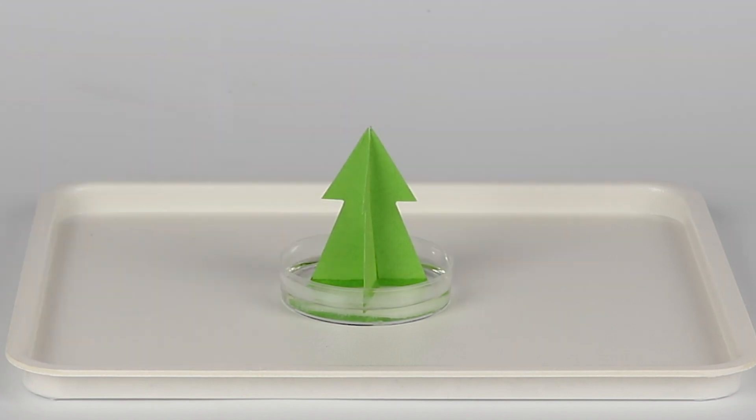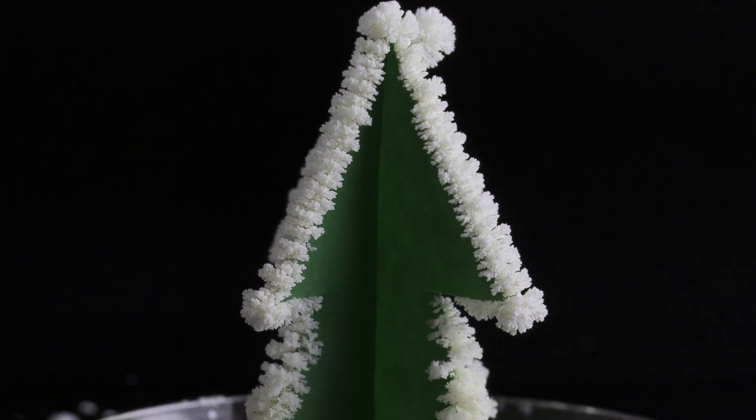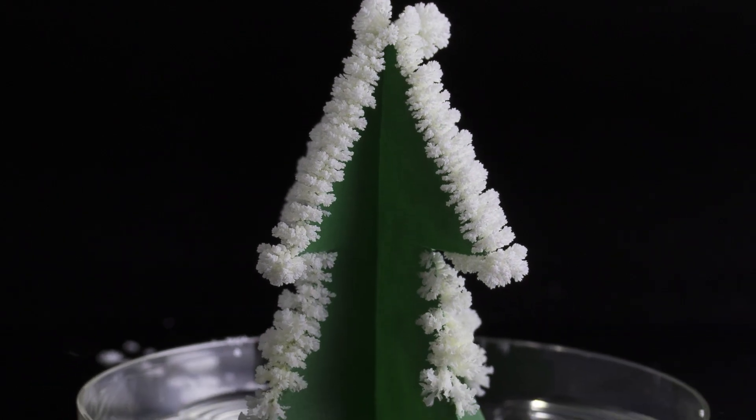Due to the capillary effect, the solution will spread all the way through the paper Christmas tree and gradually cool down. The solubility of the sodium chloride will decrease and as a result, the sodium chloride will precipitate in the form of beautiful snow-like crystals covering the tree.